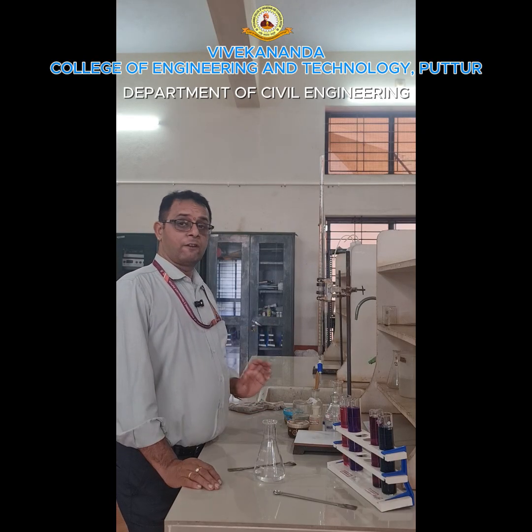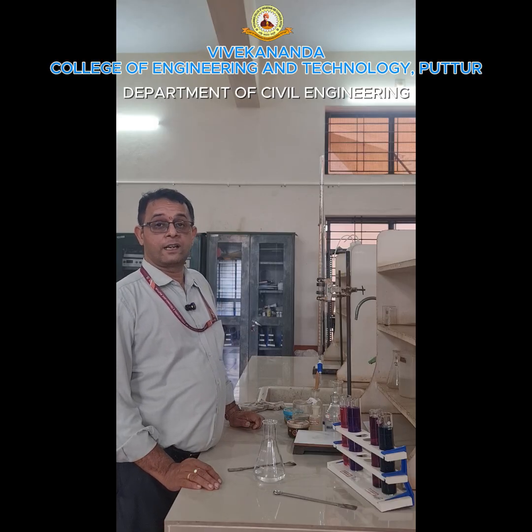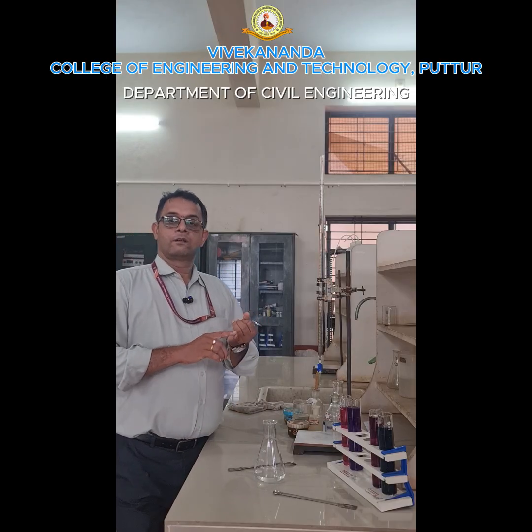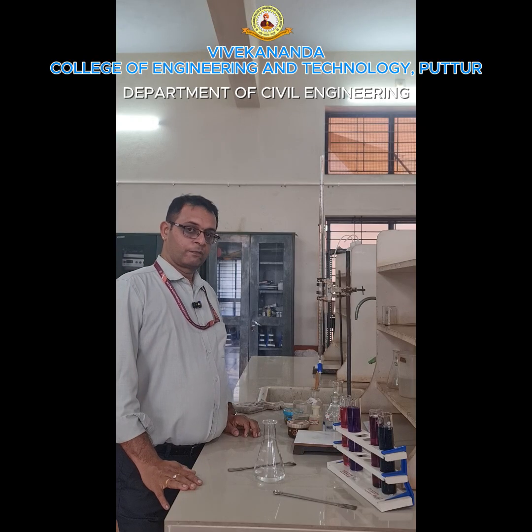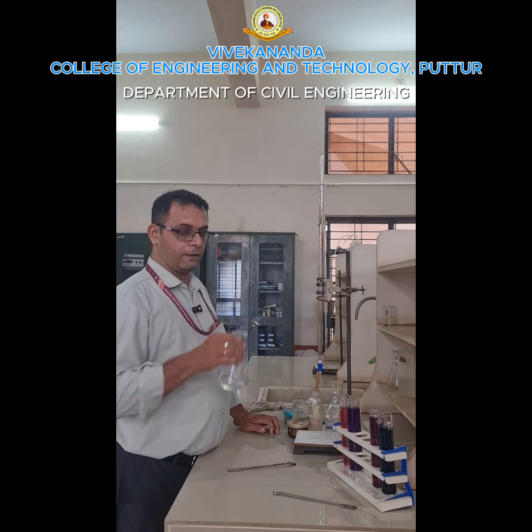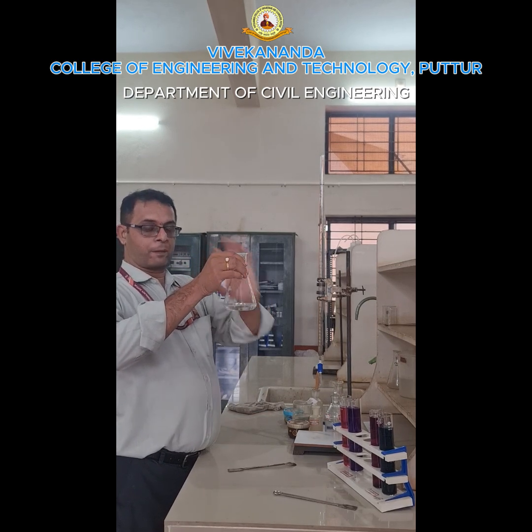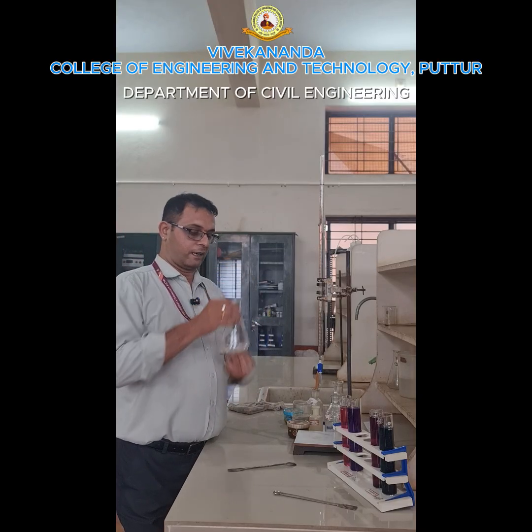First, I will find out the total hardness of the water. Total hardness of the water is determined, which includes temporary hardness as well as permanent hardness. So now I have taken a raw water sample. In this water sample, both temporary as well as permanent hardness are present. So together we call it total hardness.